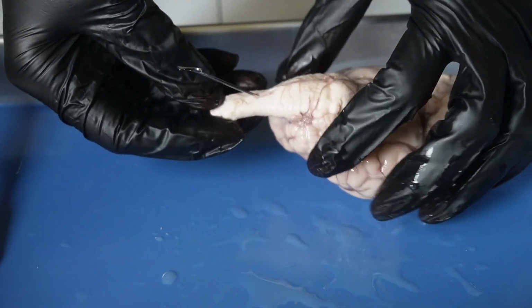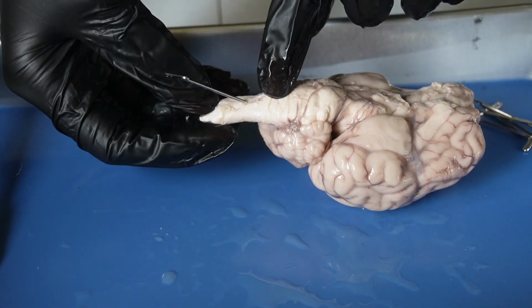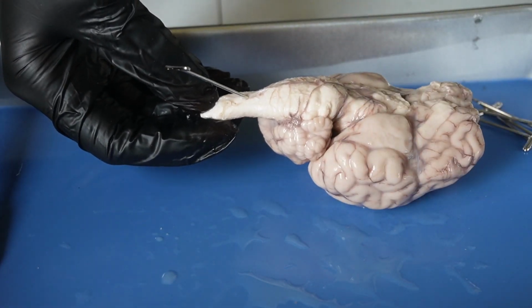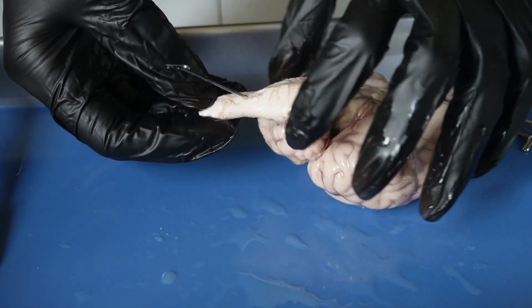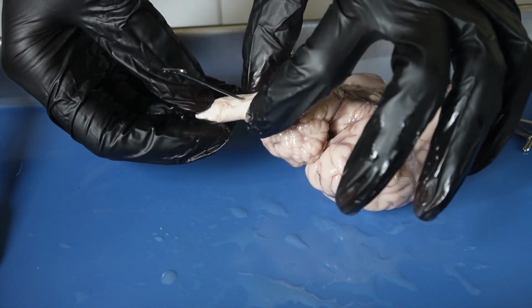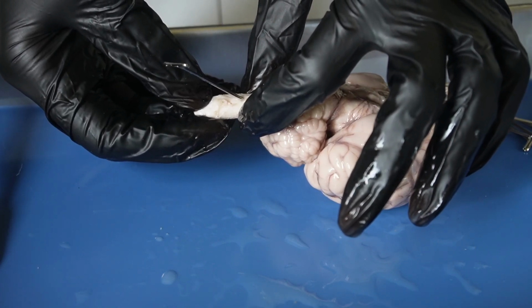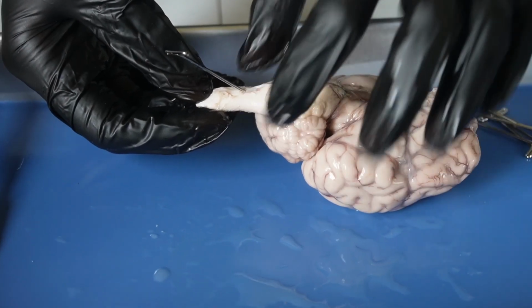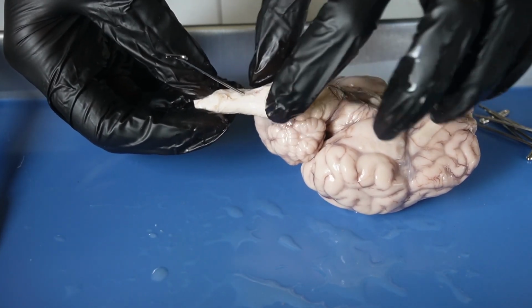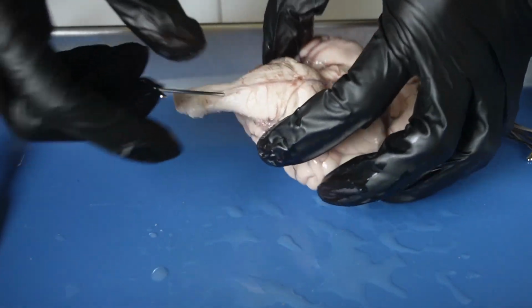So the medulla oblongata is underneath the pons, and it controls our reflexes as well as other involuntary movements such as posture.